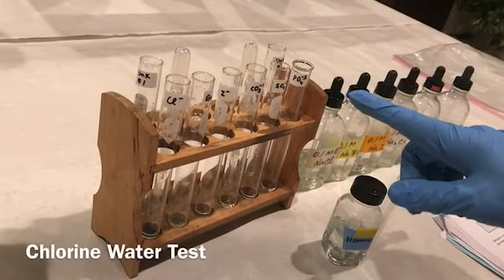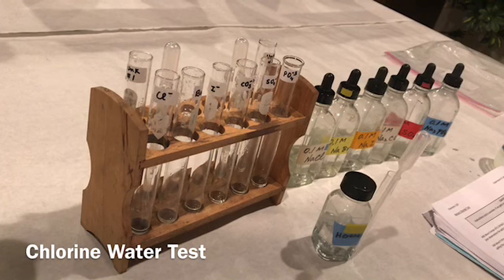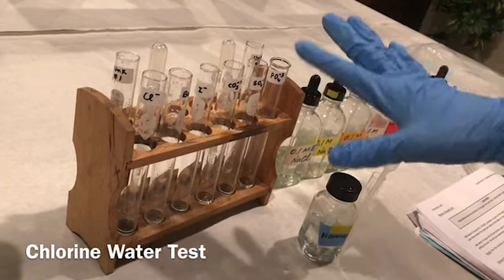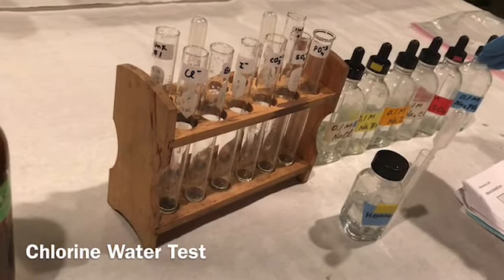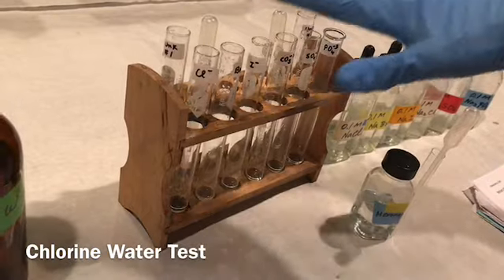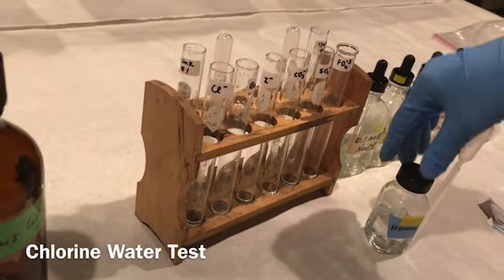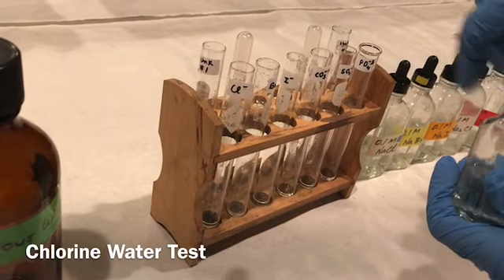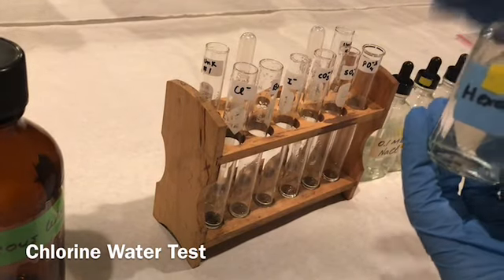Okay, so now I'm going to perform the chlorine water test, and I discarded all the solutions from the barium chloride test, rinsed the test tube well with DI water, and then I already added all the 6 test solutions into the respective test tubes. Now I'm going to add 10 drops of hexane into every test tube. This is the organic compound, hexane.